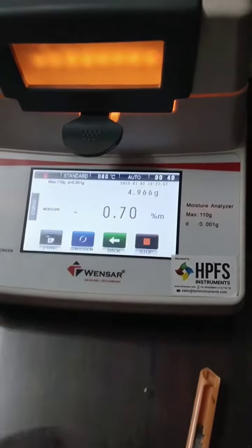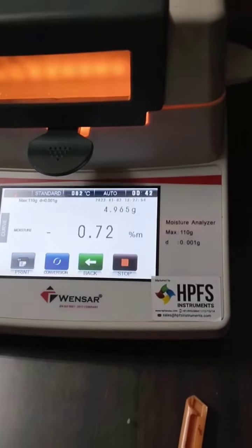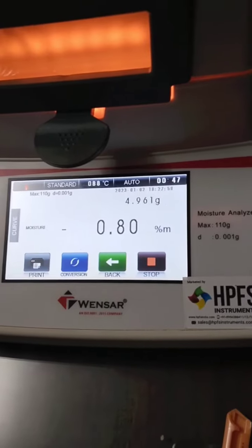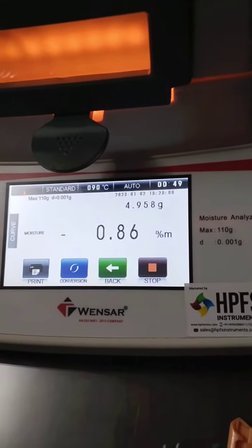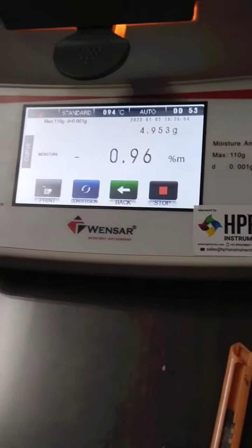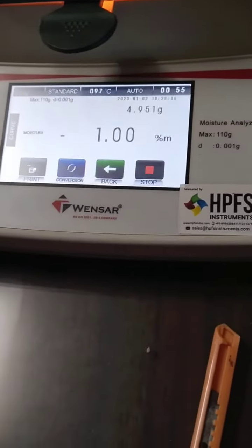We will reach the temperature. The heat will be faster and the exhaust will be faster. The temperature range is about 200 degrees. We can make the temperature up to 200 degrees.